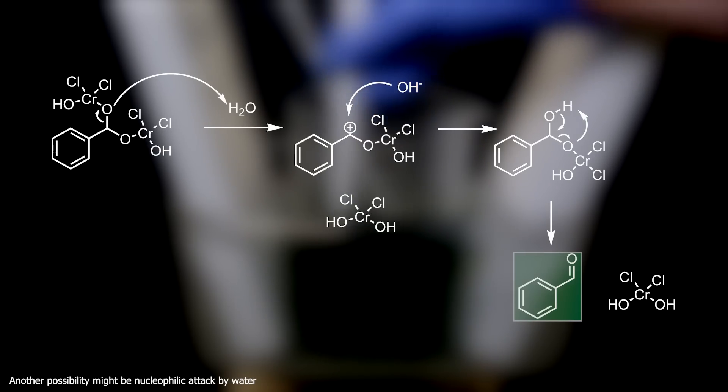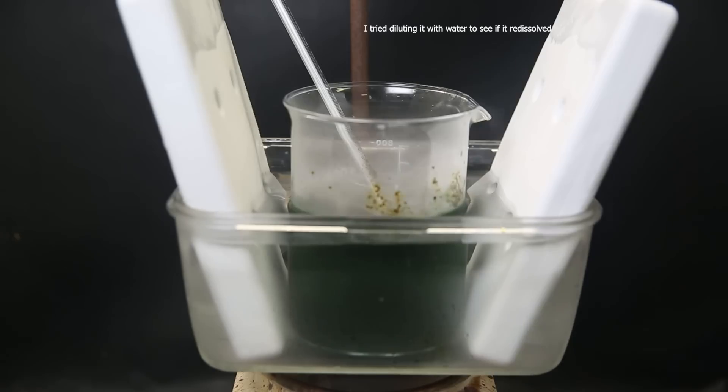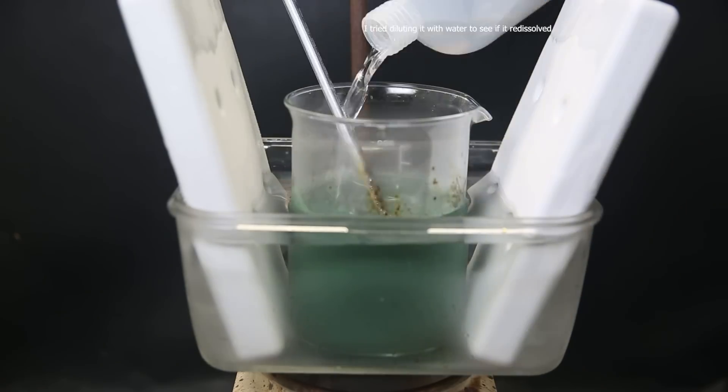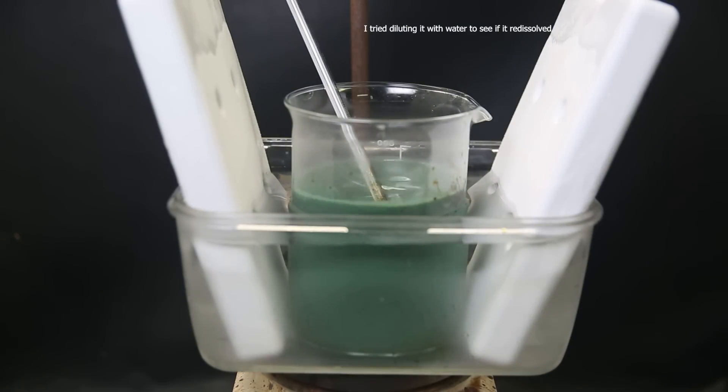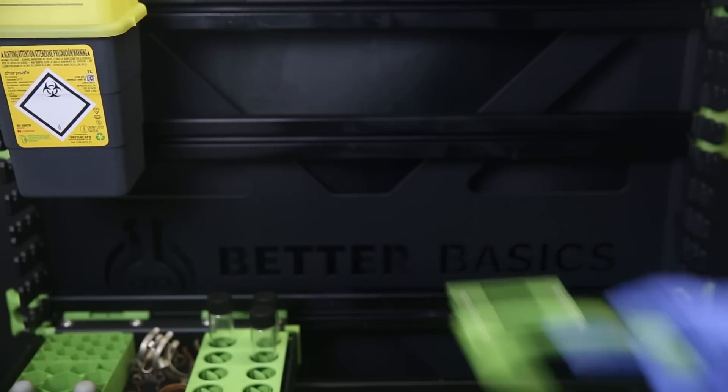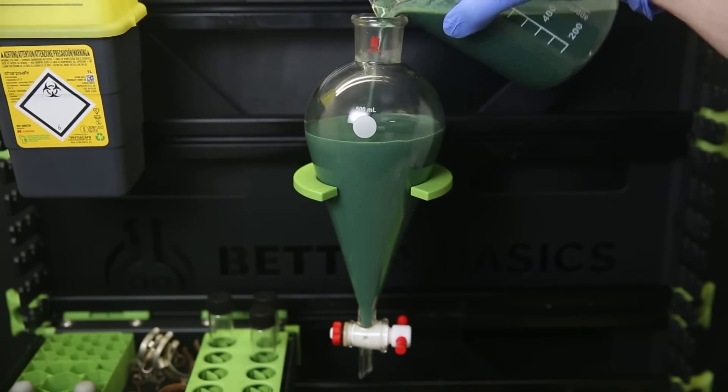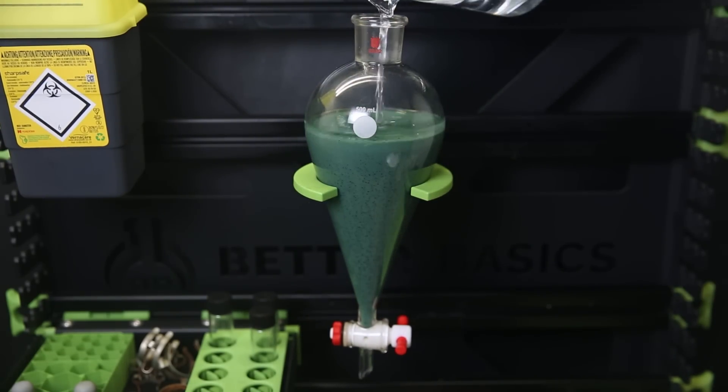The formed chromium compound likely reacts with water too to form a chromium-3 compound. Towards the end of the addition, a bunch of the chromium salt suddenly precipitated and stayed suspended. So potentially, it could be filtered to make the extraction easier. Maybe adding more base would re-dissolve it, but I didn't try it. After leaving it to stir for a second, I set up a separatory funnel and transfer the mixture in portions. I then add some diethyl ether to extract the benzaldehyde, and then mix the layers.